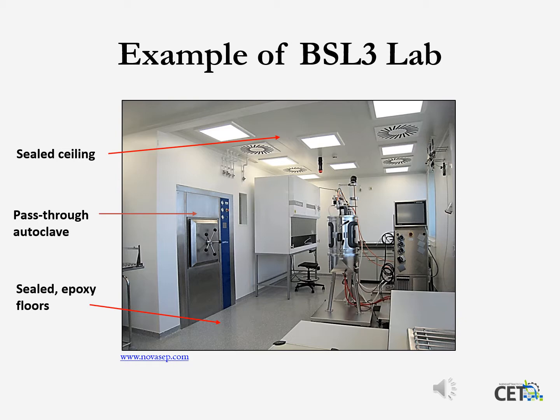Those mechanical features used in BSL-3 labs include: they must be in an isolated zone of the building. These labs must be isolated. They must have a restricted entry. That means biometrics or the pin pad. They must have inward flow of air. That means the air is always coming into the room. The air in the room cannot leave the room and get out into the building. That's one facet of the control of aerosols.